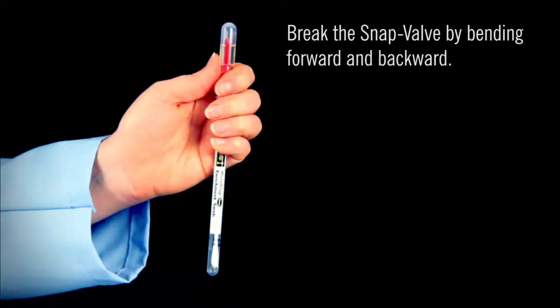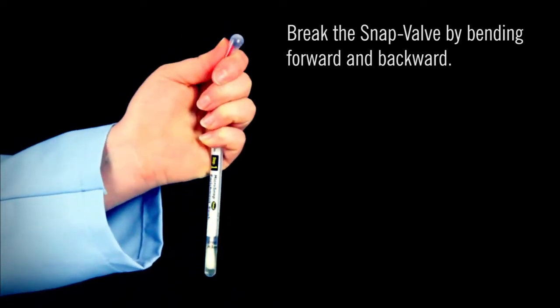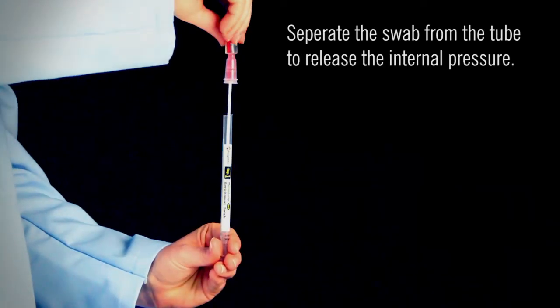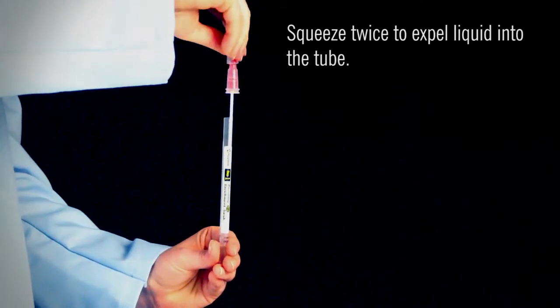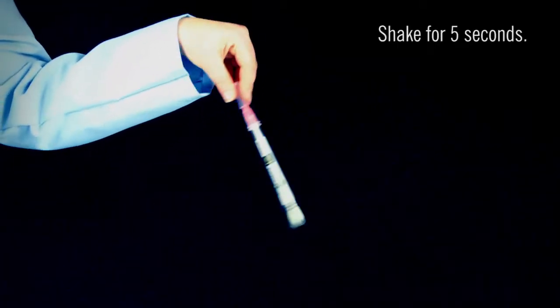Hold the device in your fist and use the thumb and forefinger to break the snap valve by bending the bulb forward and backward. Separate the swab from the tube to release the internal pressure and squeeze the bulb twice to expel liquid into the tube. A small amount of enrichment media will stay in the bulb. This is okay. Replace the swab in the tube and shake for 5 seconds.